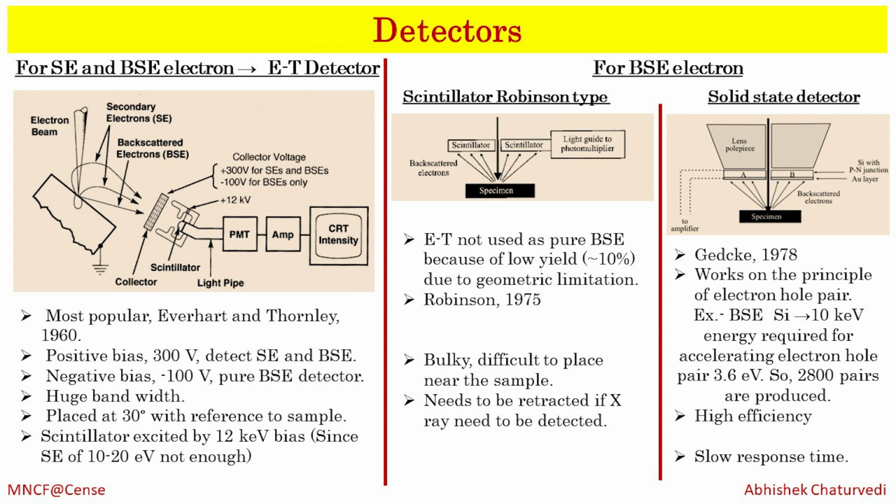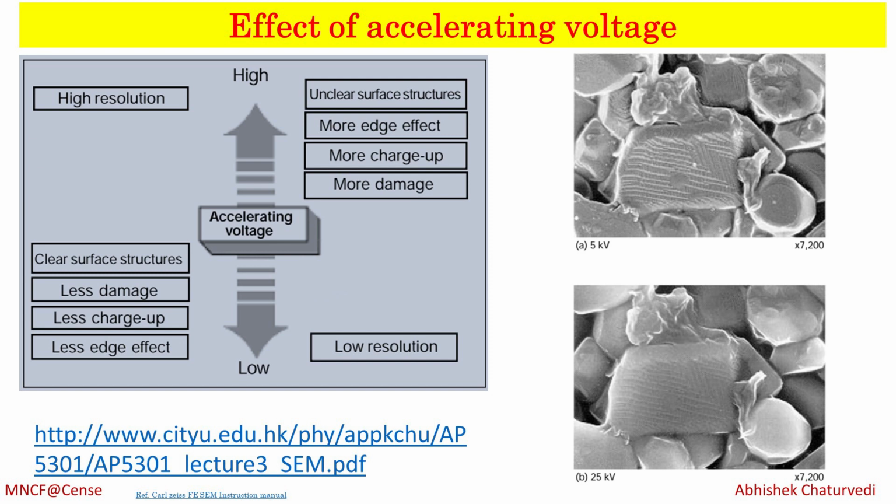We have different kinds of detectors. As I have already told you, I have a secondary electron detector, I have a backscatter detector, and also I have the EDS detector, energy dispersive spectroscopy detector. There are only 2 to 3 slides more with me.